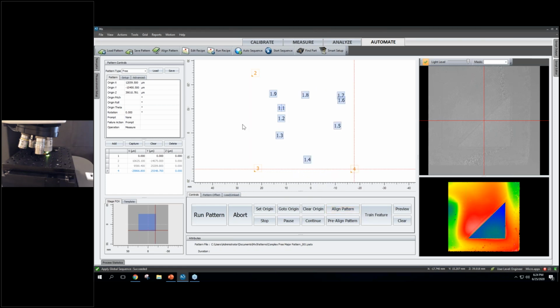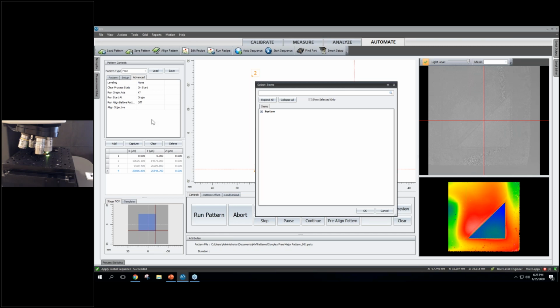So now as we go through and do this, since we're actually going to be taking measurements and not just going visually off of what we're seeing in the field of view, and an operator is going to be adjusting it with the joystick, we may need to optimize the measurement controls as we switch to the other objective to get better data. So what we can do is rather than just setting an alignment objective, we can tell it to import a settings file, particularly to be used just for the alignment. So similarly to how we added the align objective control, I'm going to add 2 other controls. There's align settings file and align settings mode.